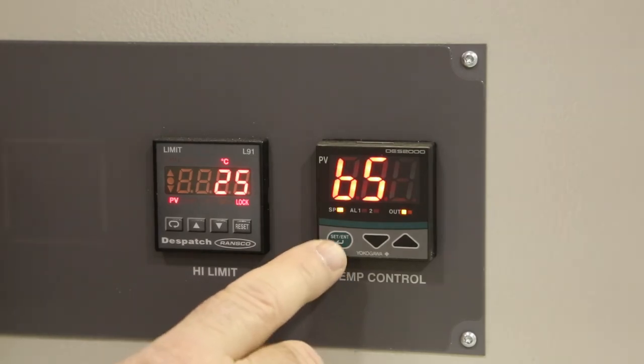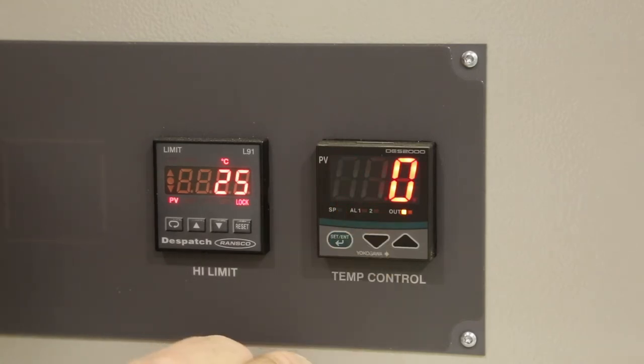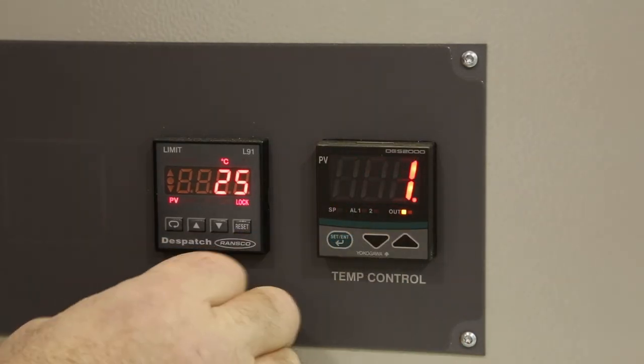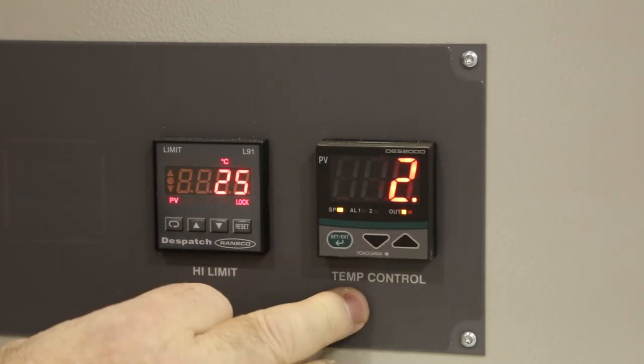Cycle the green button until you see LOC. This should be set to 0 if you want to change parameters, 1 if you want to change the set point only, or 2 if you want to lock out all changes to the controller.